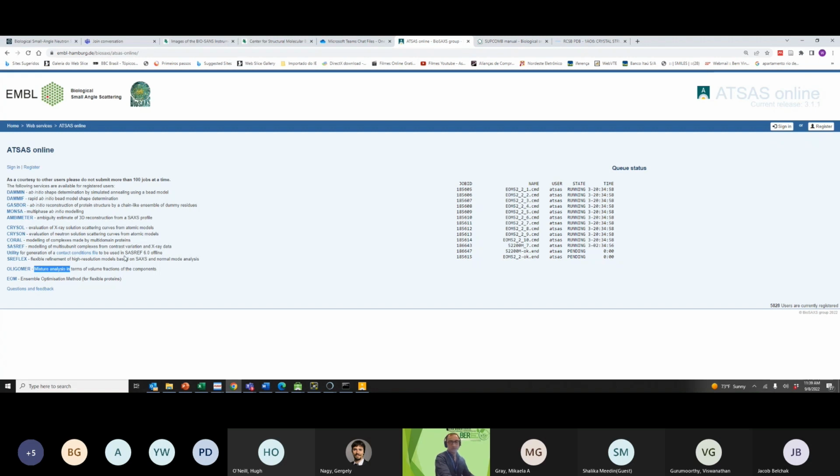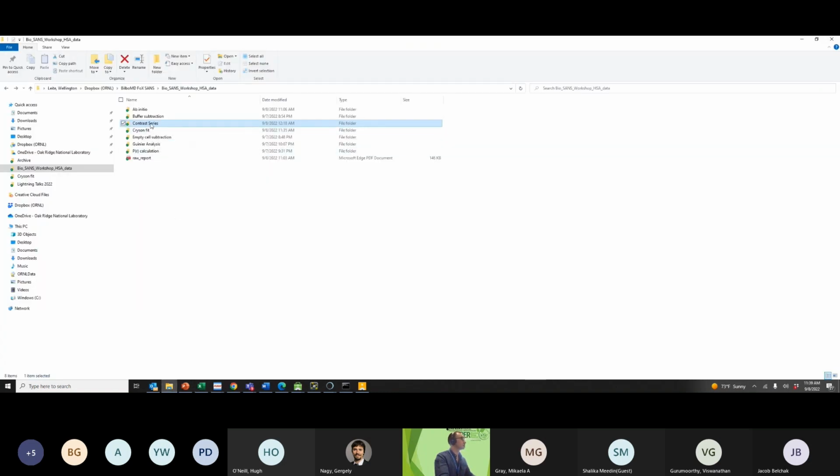I think now, if you have any questions, you can start working on the data yourself. And if you have any questions, I'm happy to help you. One good starting point is the contrast variation series.